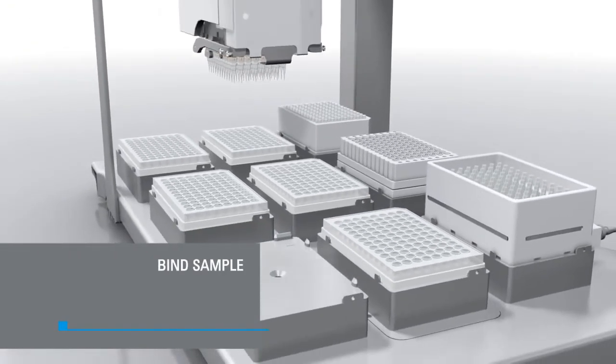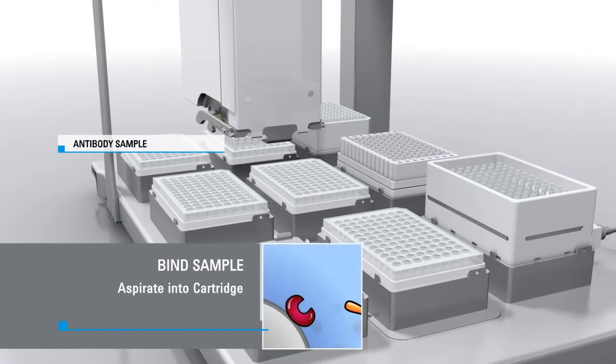Next, antibody sample is bound to the resin in the cartridge bed by aspirating into the cartridges from the antibody sample plate.